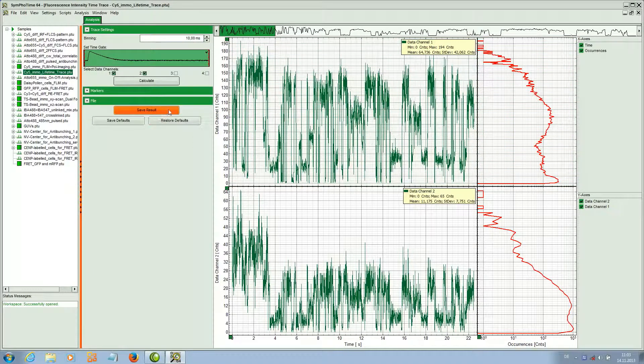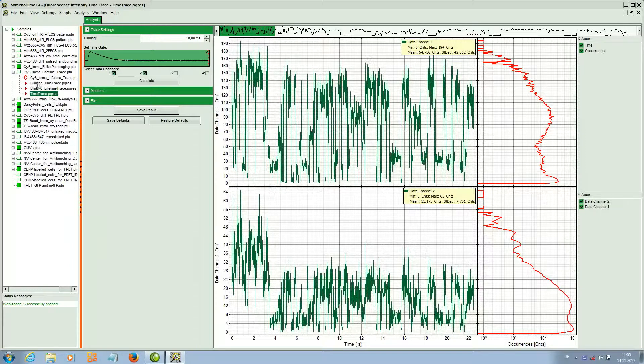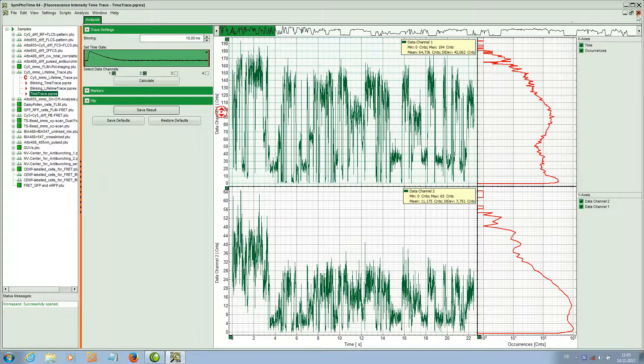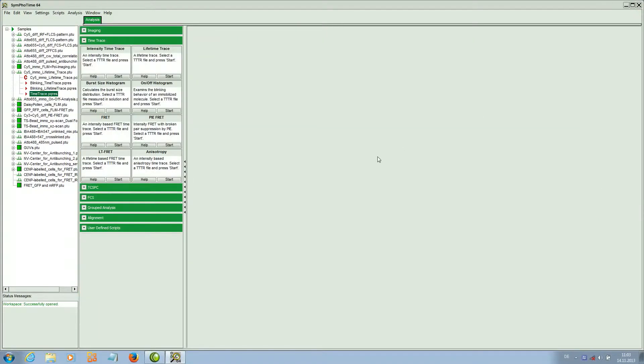We can save the result and here we get the result file that contains the results.